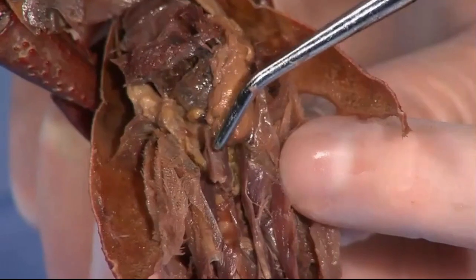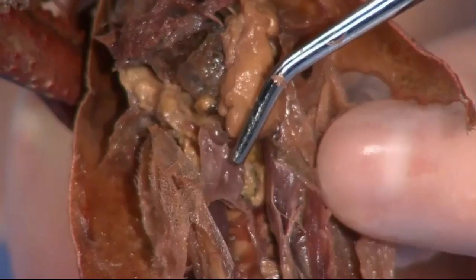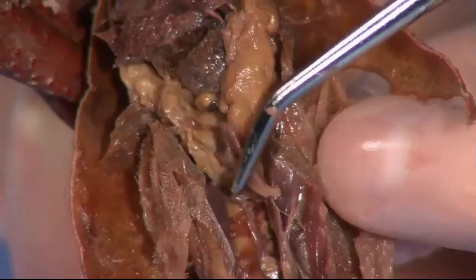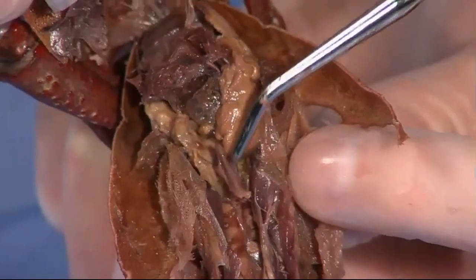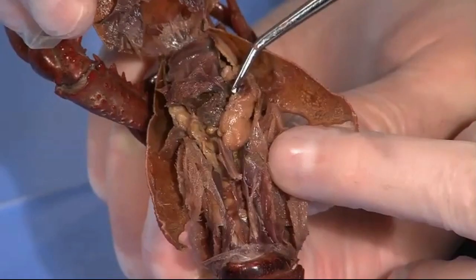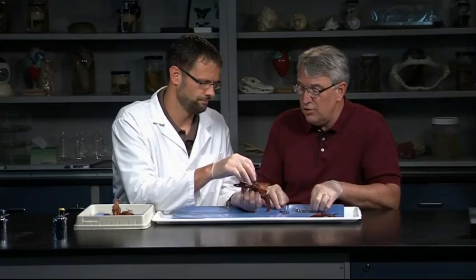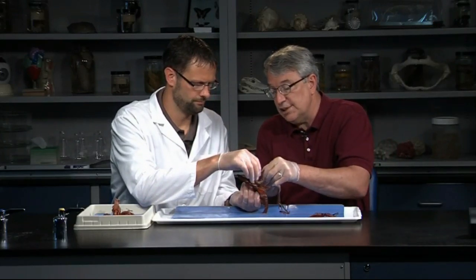You can see the heart right here. It's got a little hole in it called the ostium. It'll be a pinkish, whitish structure, sitting right there behind these large digestive glands, kind of in that little group right there. It's probably the first structure the students want to look for, and it's probably the hardest one to keep intact. Let's go ahead and remove that upper carapace there, and then you won't have to keep holding that up.